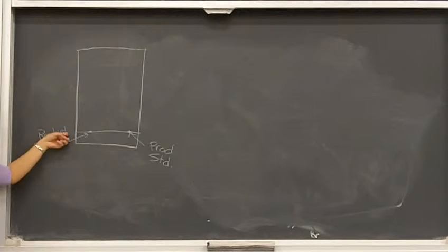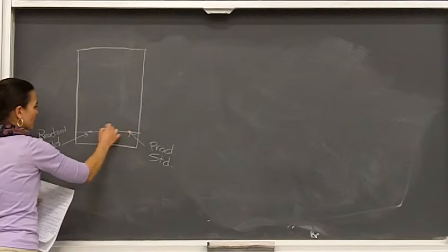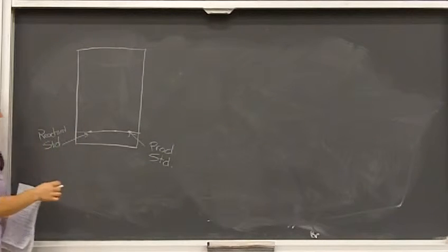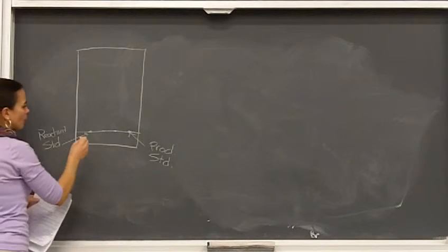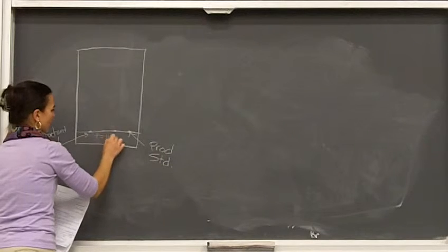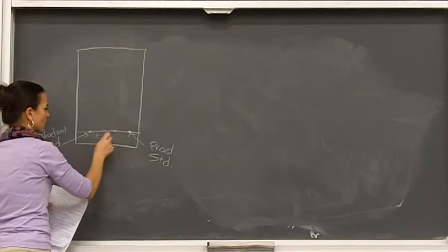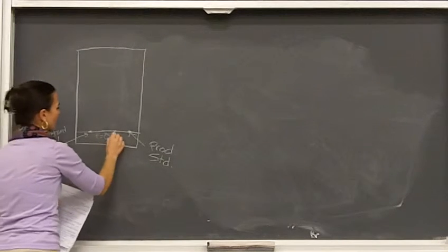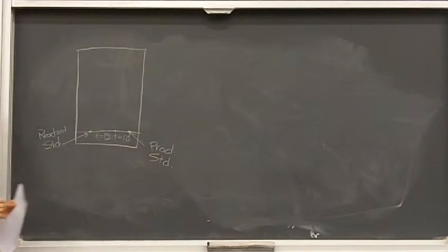You want to be spotting the reactant standard and the product standard on each of your TLC plates. In between, you don't want things too on top of each other. You want to space out your spots and not too close to the edges of the TLC plate because they'll run off the side. But you're going to want to spot your reaction at time 0. And so that time 0 is right after you've added the cyclopentadiene to your reaction mixture, right when you go back to your hood, you want to spot the reaction mixture. And you probably will already see the reaction starting to go. Okay? Then you want to spot it at 10 minutes, at the end of reflux. Okay?